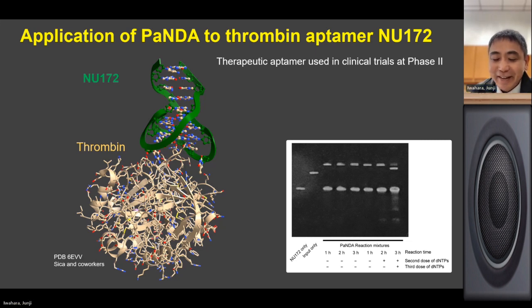Thank you. No problem. I got another question, if that's all right. Please, go ahead. Just one quick question that I wasn't going to ask. Is your 0.4 millimolar sample in a Shigemi tube, or is it a regular 500 to 600 microliter sample? Yeah, we typically use just a regular tube. Okay.